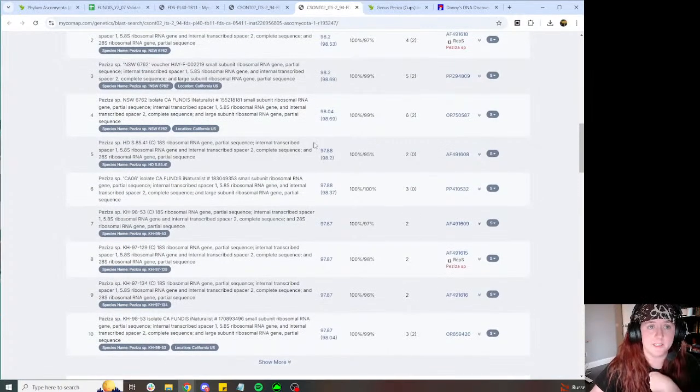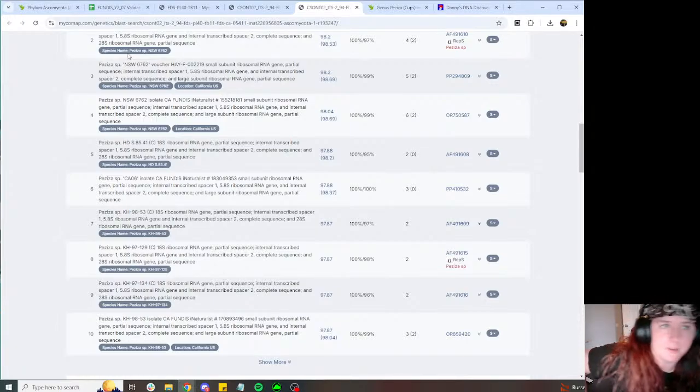And when I'm assigning temp codes to things, I'm not saying this is for sure a new species. It's just a helpful convention to group similar sequences together so that if someone does go write a paper on something, they can say, okay, this group and this group, and then they can go do a tree and do the micro and do everything and decide, okay, these are separate species, or these might just be the same species and these temp codes need to be combined.